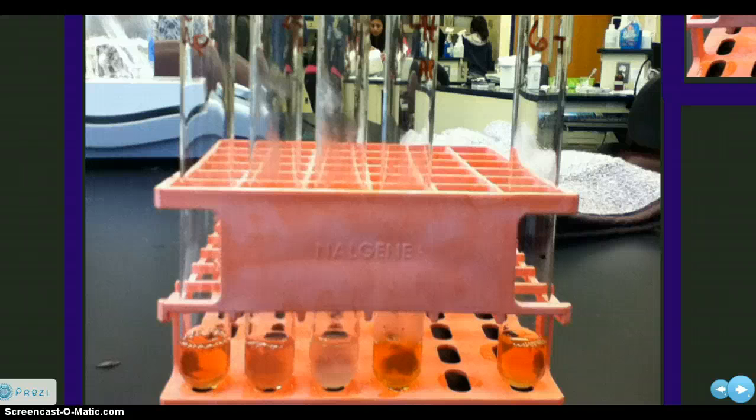Test tube 4 was at 80 degrees Celsius, and there was a definite change there. So we labeled that as a 3. And test tube 6, which was our control, again, was a 3. It was at room temperature, about 37 degrees Celsius.